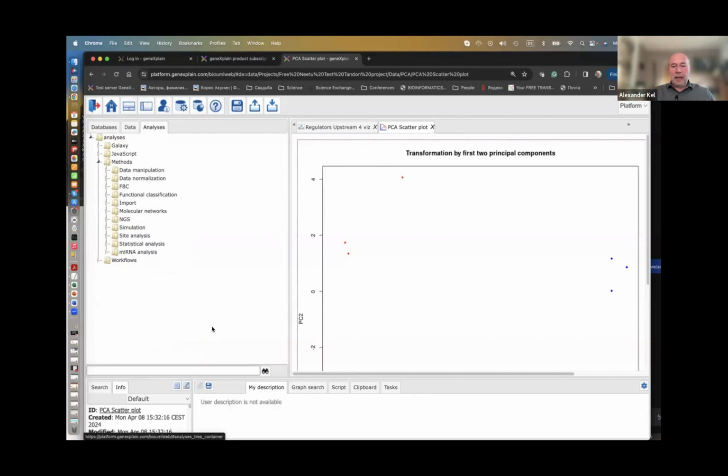All right, so I have questions in my chat. Actually, two questions. The first question: is history stored? We were already talking about that. History is stored for all the analysis conditions that are used, so Neetu has answered already. Yes, we have it. You have it in an info box. And the second question: do you have any tools for combining technical and biological replicas in a single data set to work with? All right, that's a good question.